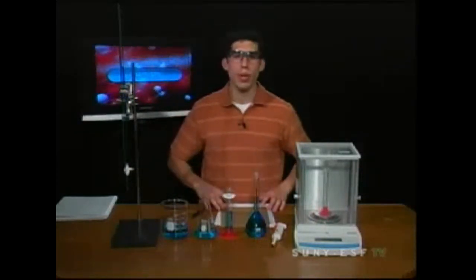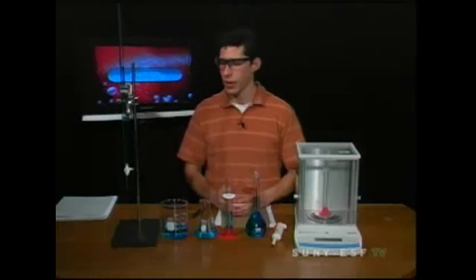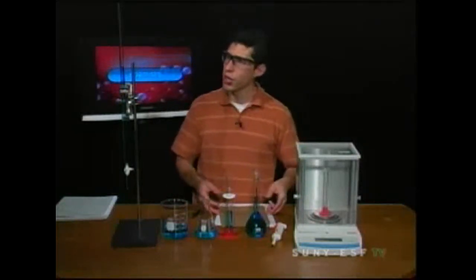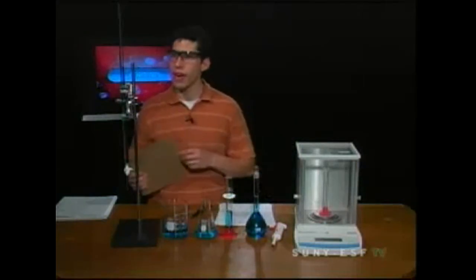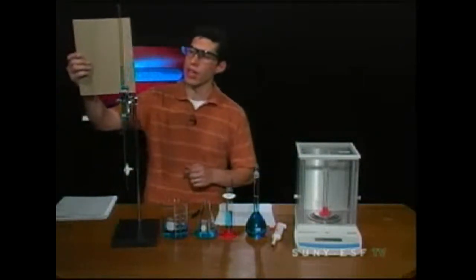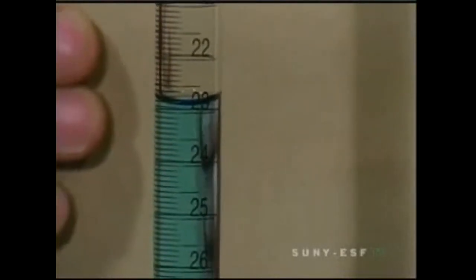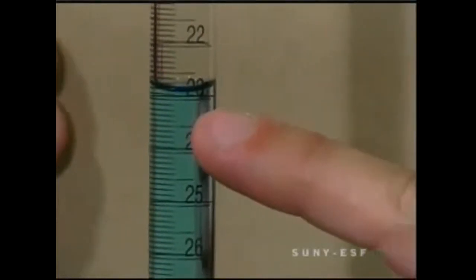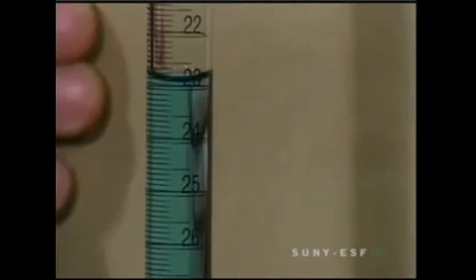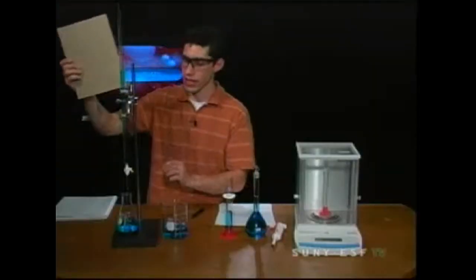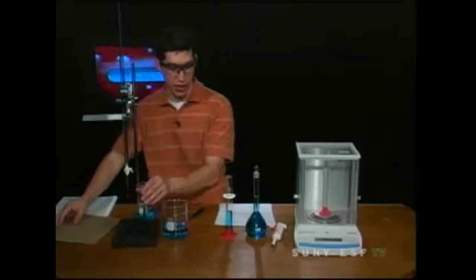The next piece of equipment we're going to talk about is typically used in titration. That piece of equipment is the burette. The burette is very, very accurate, even more accurate than the graduated cylinder. It has marks in tenths of milliliters. Right now we're marked at 23 milliliters that you can see. If I drain some of the liquid, we can see that it goes down, and we've gone down to about 24, 24.2 milliliters or so. Very accurate for titration, and we'll talk about that in another segment.